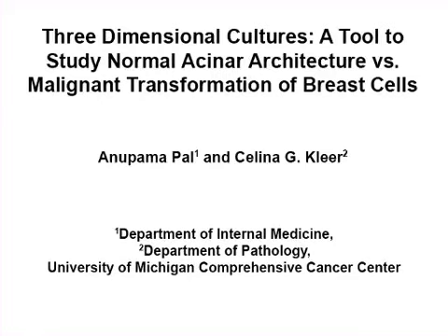The overall goal of this procedure is to utilize the three-dimensional culture system as a means to distinguish the benign breast phenotype from the malignant breast phenotype.